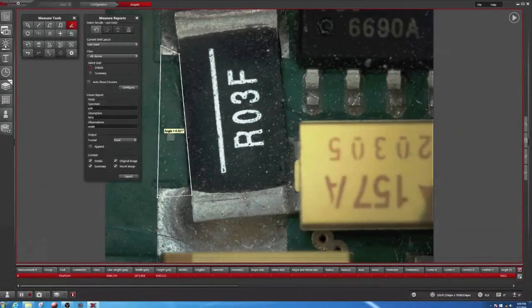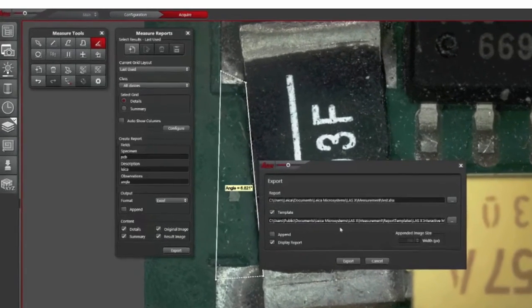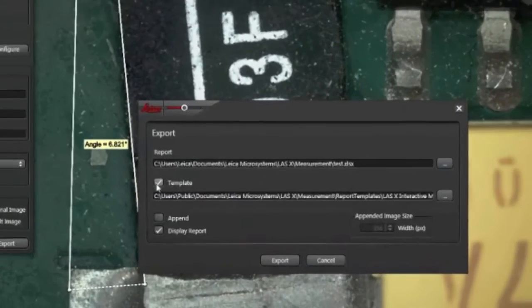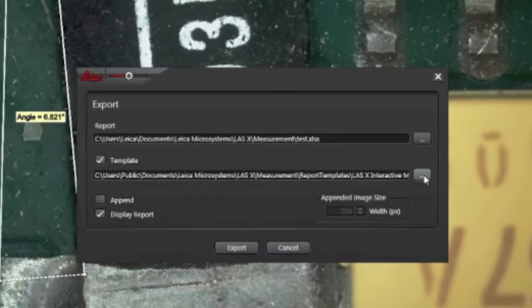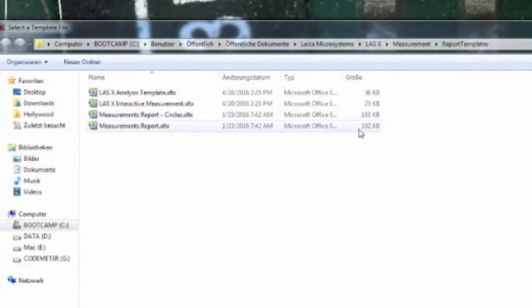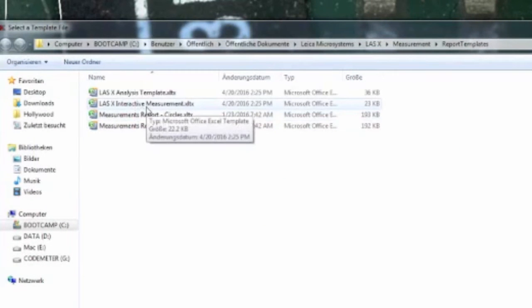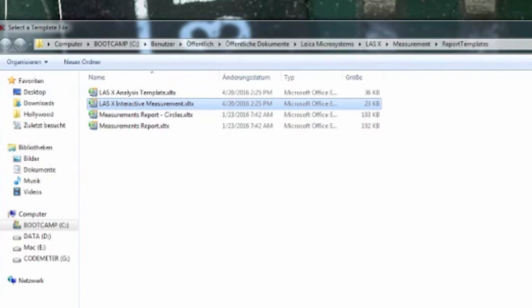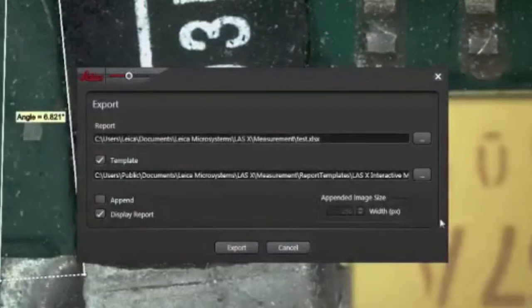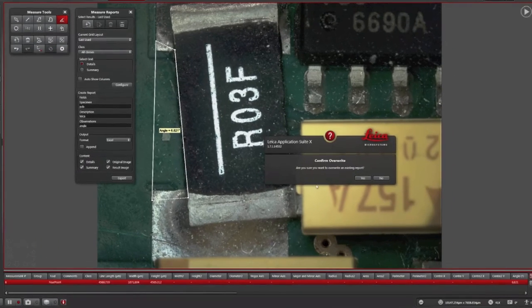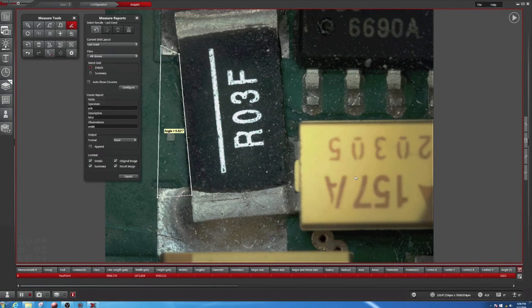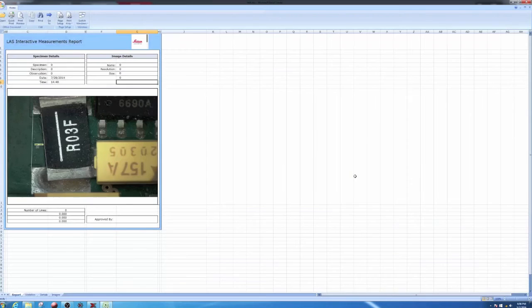If you want to use a template, however, you press on export and choose a template here. Now we'll choose LASX Interactive Measurement. If I export this, I will overwrite the old test, and now it looks completely different.